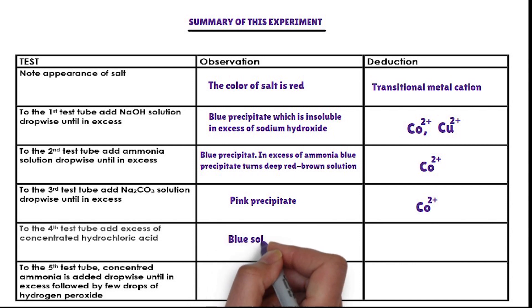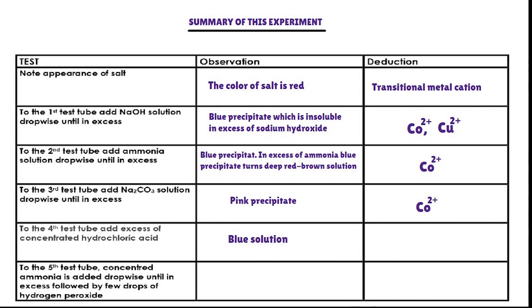Confirmatory tests. First confirmatory test: to the fourth test tube, excess of concentrated hydrochloric acid is added. The cation that forms a blue solution when it reacts with concentrated hydrochloric acid is cobalt-2 ion. Cobalt-2 ion is confirmed. The cation present in the salt is cobalt-2 ion.